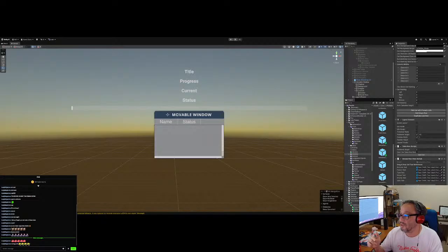If you need to go to 51, you'll get everything between 40 and 90, and if you go above that, you get the next sequence, but the previous ones get deleted, or even better, replaced. And so you never run out of memory.